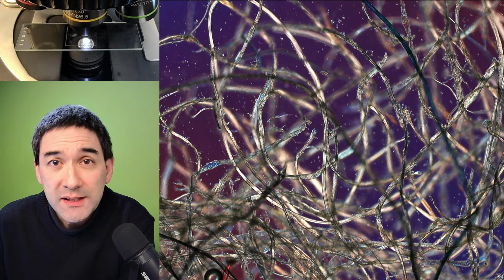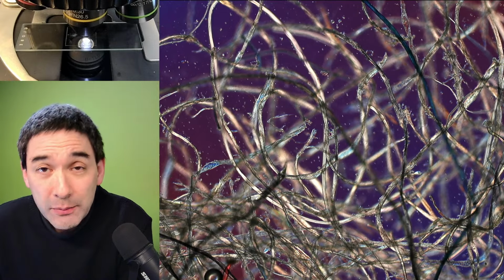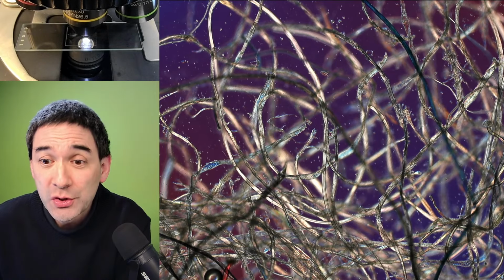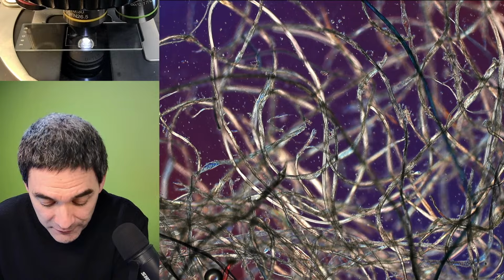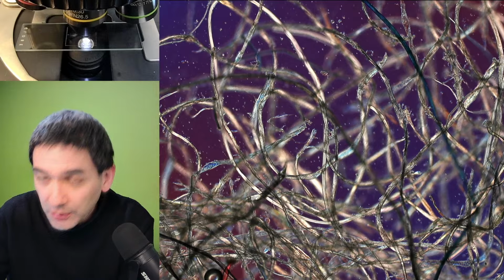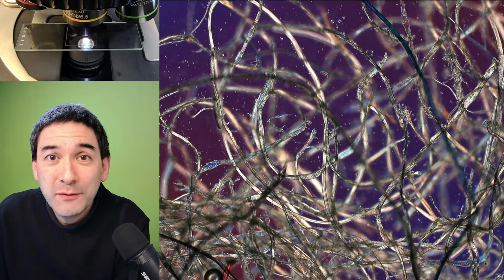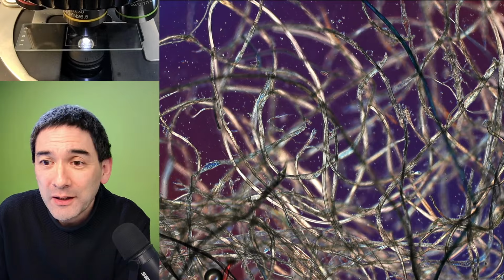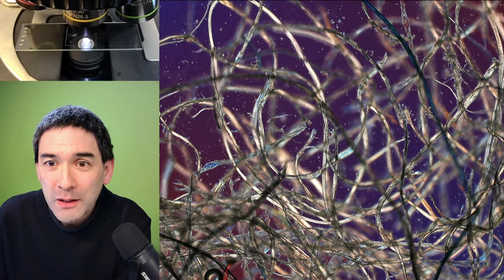In many cases, these are natural fibers from plant material, from clothing a lot, and sometimes also synthetic fibers. I thought we're just going to have a look at a couple of samples that I've prepared today, and we're going to take it from there. Please feel free to write comments into the chat, and I can try to pick up on those.